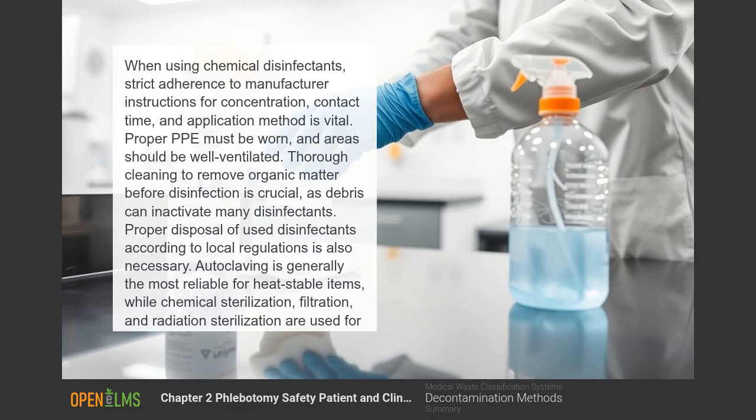Proper PPE must be worn, and areas should be well ventilated. Thorough cleaning to remove organic matter before disinfection is crucial, as debris can inactivate many disinfectants. Proper disposal of used disinfectants according to local regulations is also necessary.